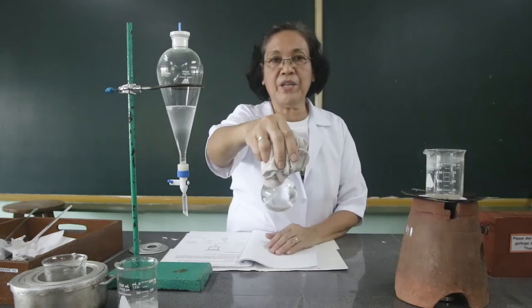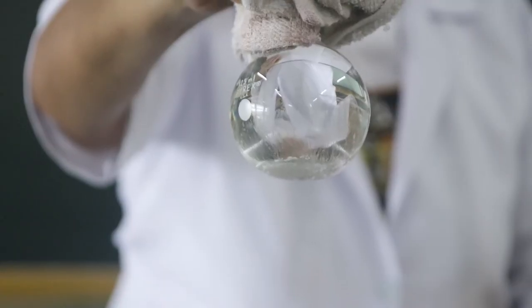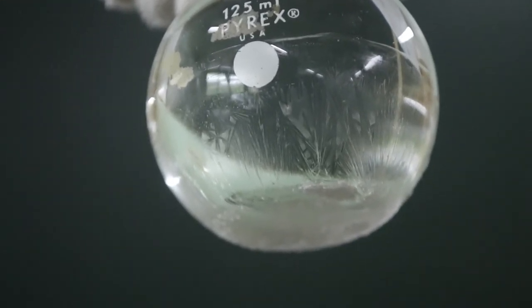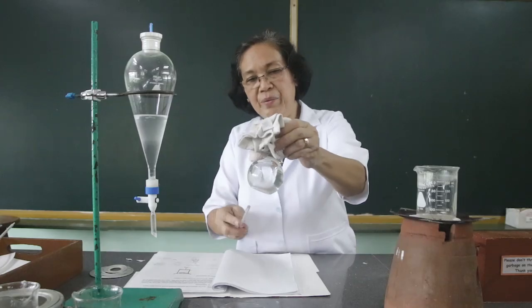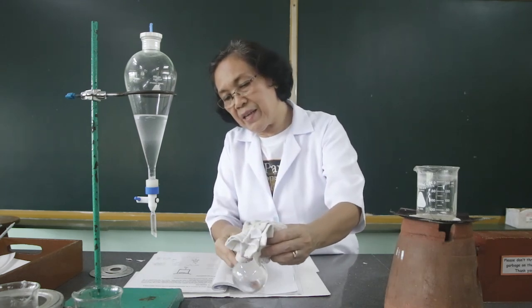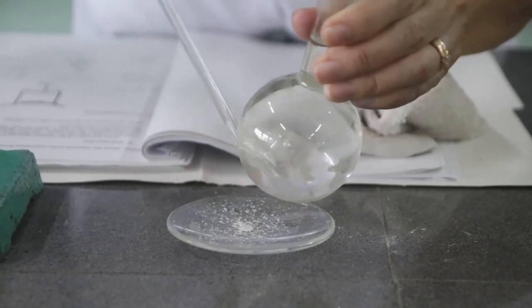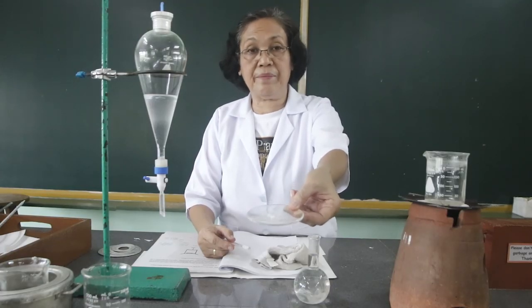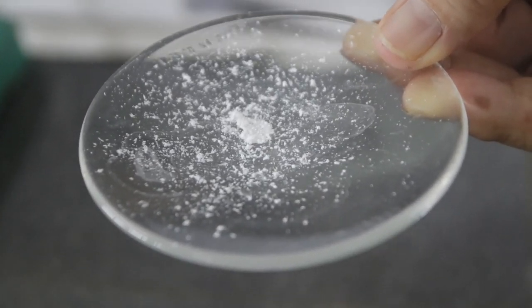I want you to observe the crystals which are deposited at the bottom of the Florence flask. We are going to scrape this out from the bottom of the flask. So we have obtained back the benzoic acid.